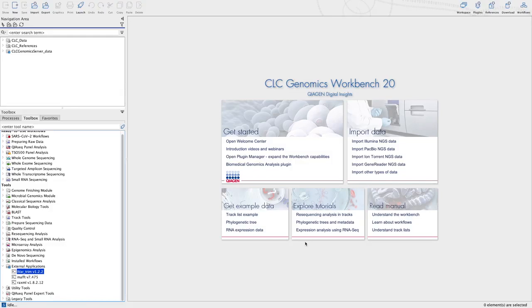That's IVAR, MAFT, and RaxML, just like you see on my screen here. And in this first video, I'll be focusing on writing an external application for IVAR, a very powerful tool from the Anderson Laboratory over there at the Scripps Research Institute. There's a ton of functionality built into IVAR, but today we're going to focus on the IVAR trim command for our first external application.